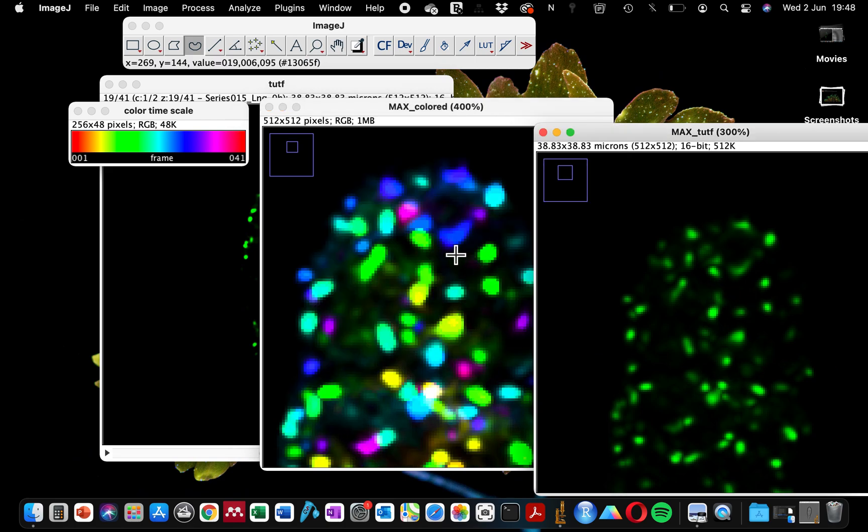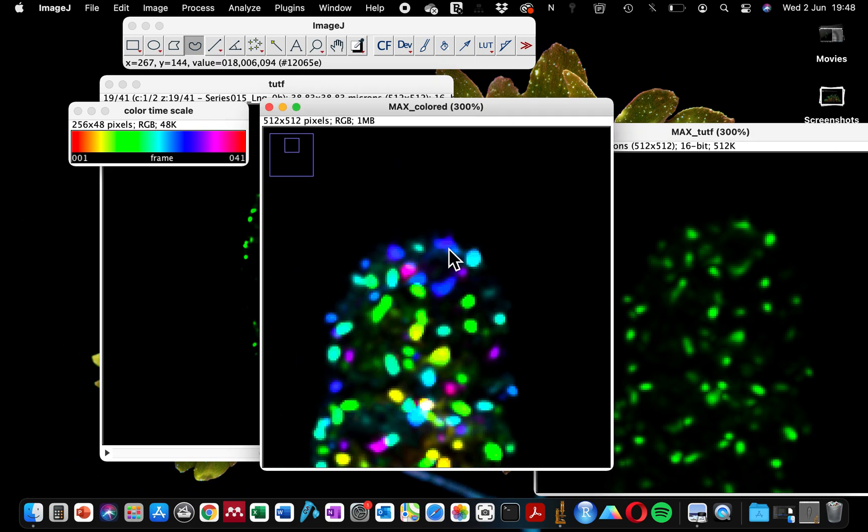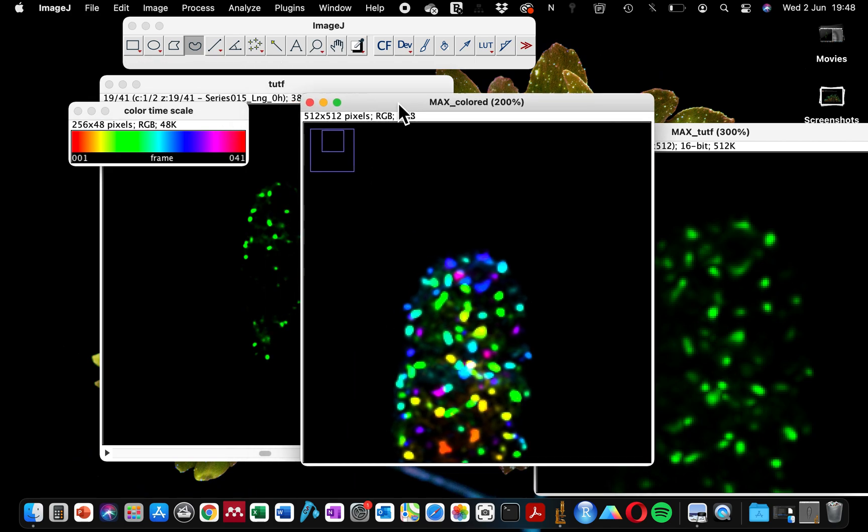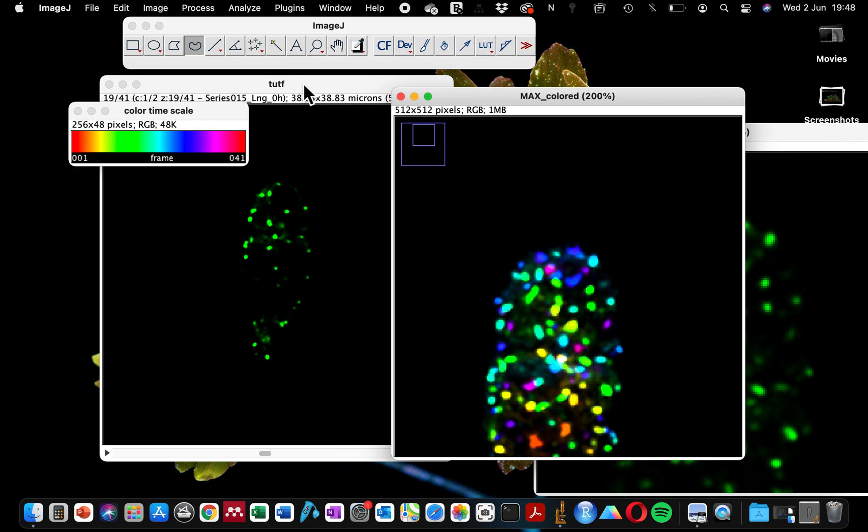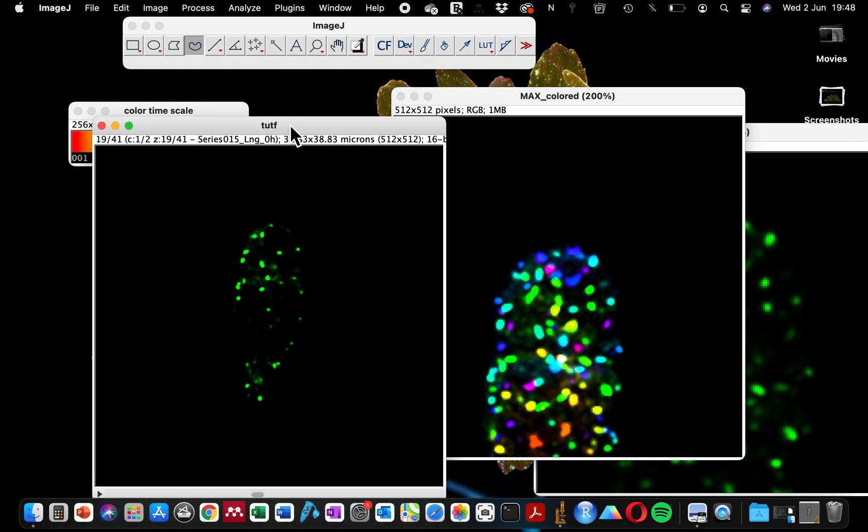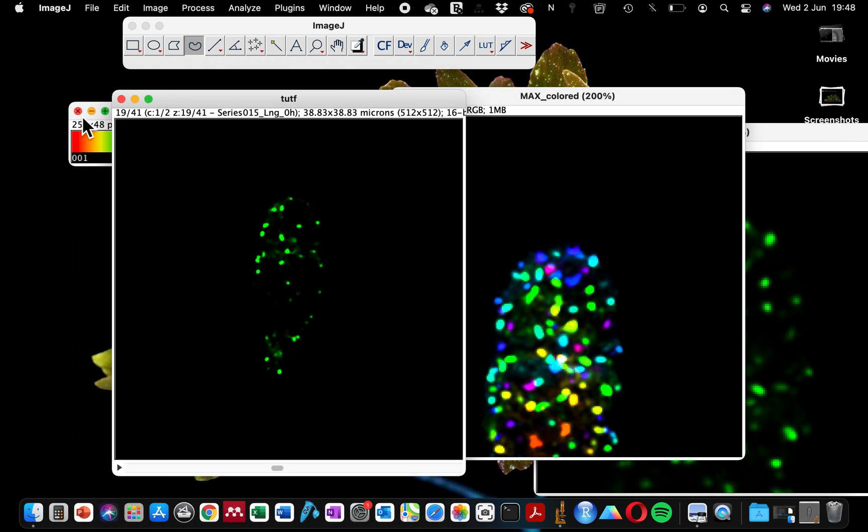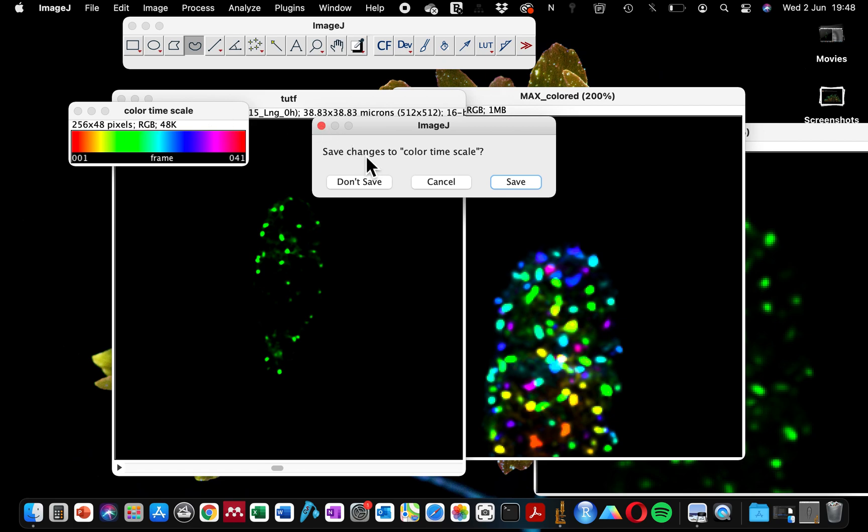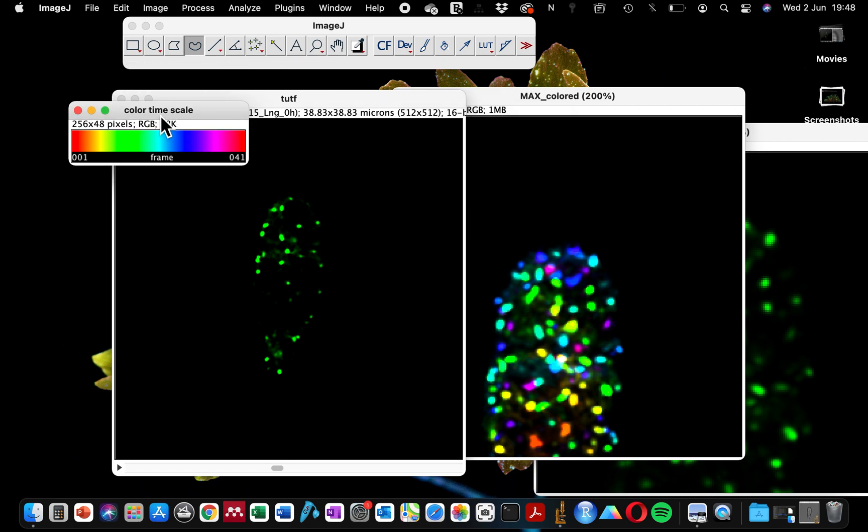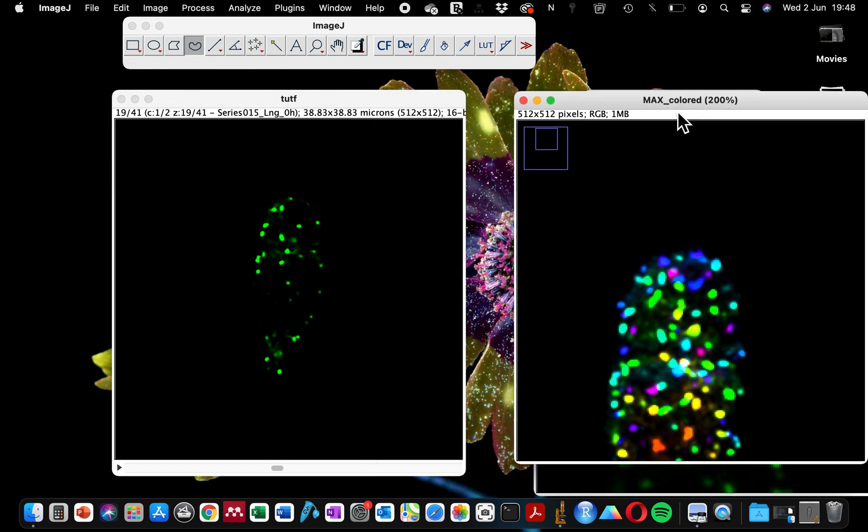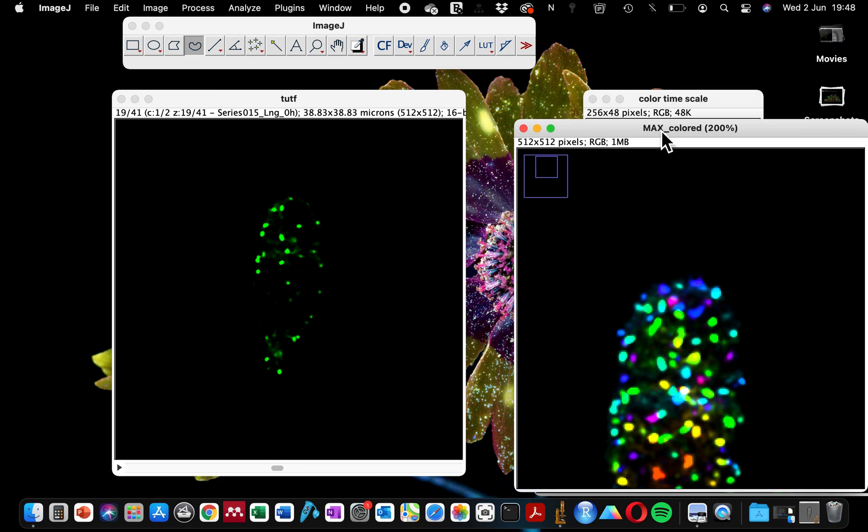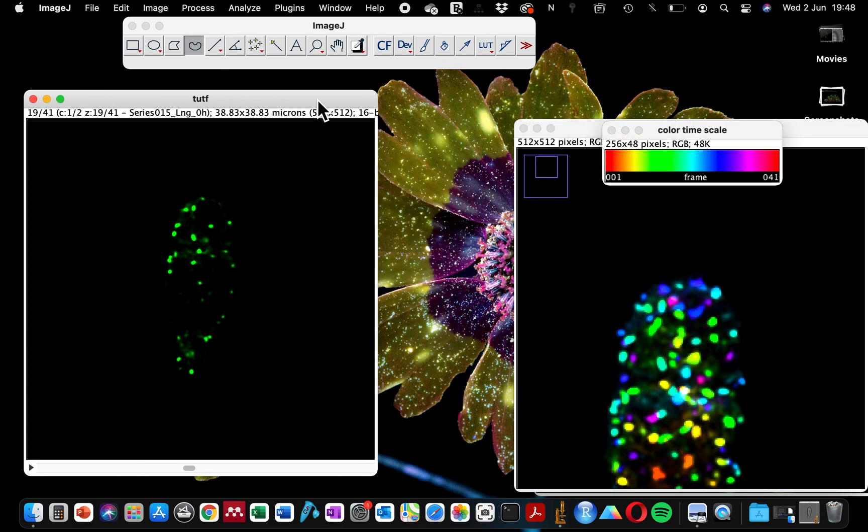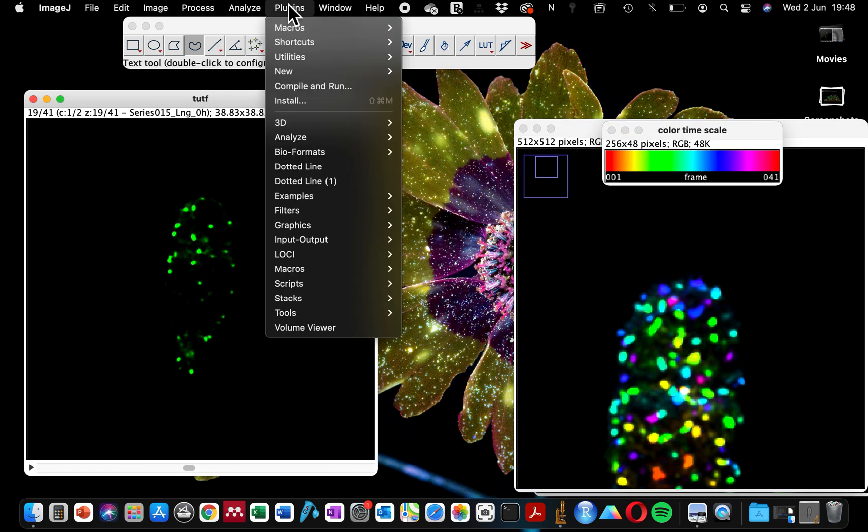This is why it's important to use color coding. You get more information apart from just showing the objects within the 3D. What about the second color coding option that I showed you earlier? What does it do and what extra function does it have?